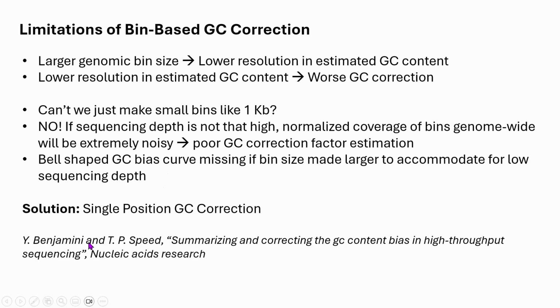Now, there is this paper which introduced the concept of single position GC correction in 2012. But reading this paper is not everyone's cup of tea. It's a bit difficult to understand, but don't worry, I'm going to explain everything about this method with example so that everything is crystal clear to you after going through the tutorial.